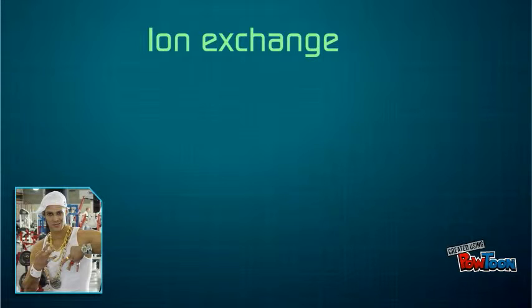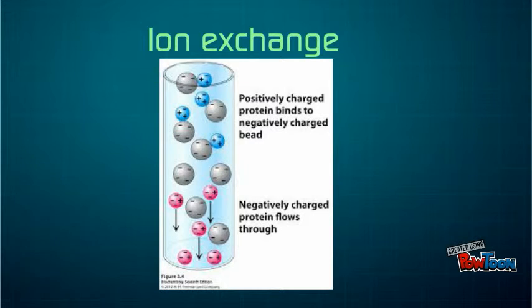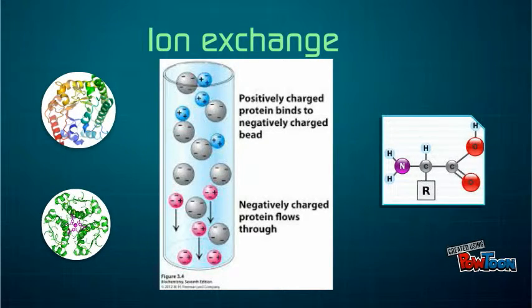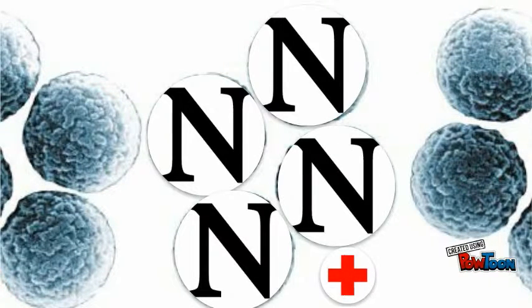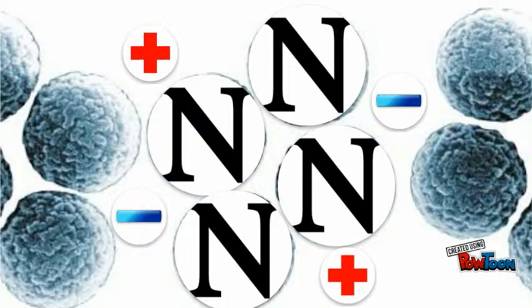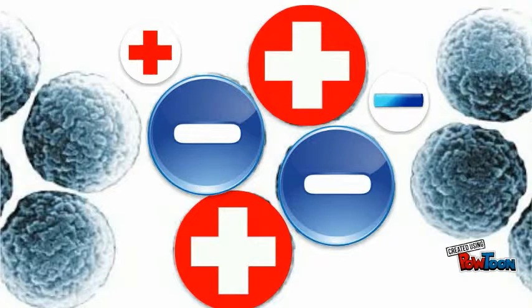Ion exchange chromatography is used to separate molecules based on the charge that they take on at various pH values, and can be used to separate anything from whole proteins to amino acids. The first step is to fill a column with resin beads of a neutral charge, and then those beads are given a charge opposite of that of the desired molecule using elution buffers, so that the undesired molecules elute first, while the desired molecules stick to the resin beads.